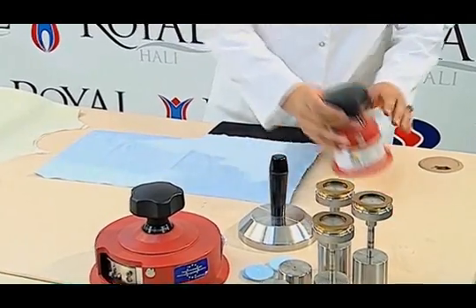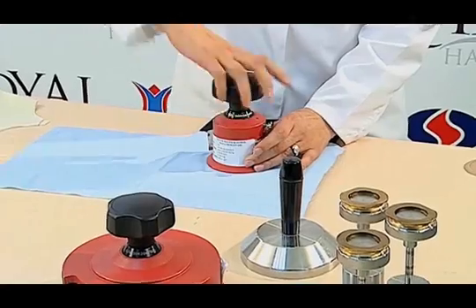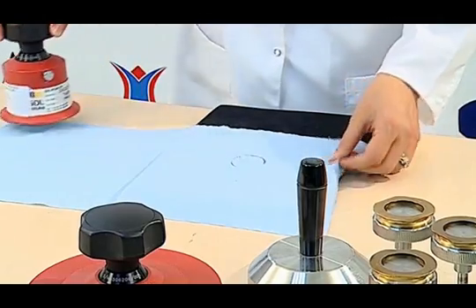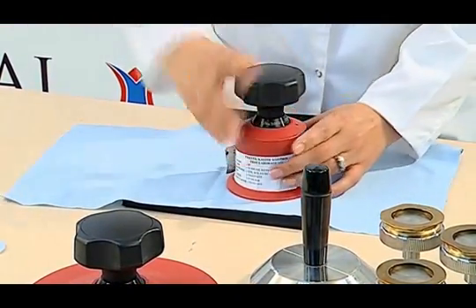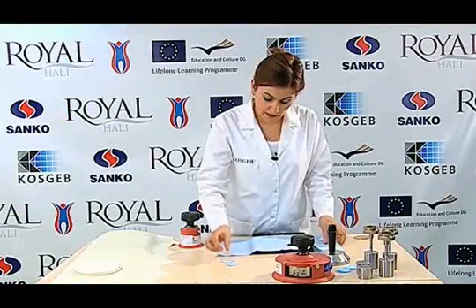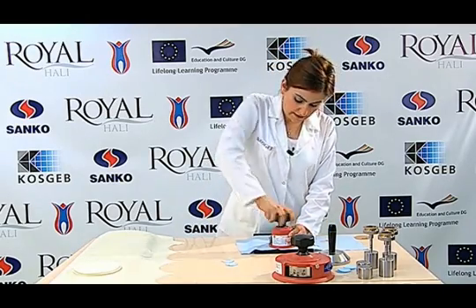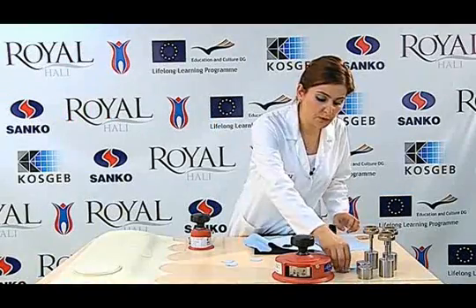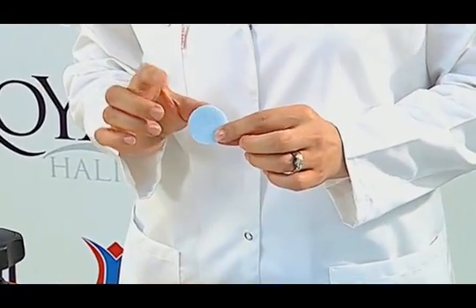While taking the sample, it is taken in a way that includes each pattern in patterned fabrics. Areas that are not wrinkled are cut 3 cm from the inside. Sponge foam is not used when the mass of the specimen is 500 g per square meter or above. Foam sponge is used only for samples under 500 g per square meter.